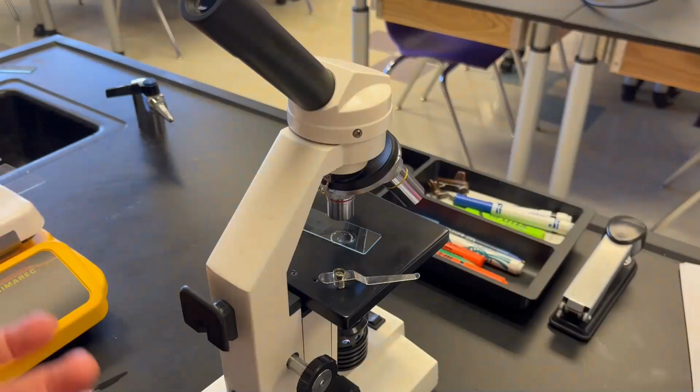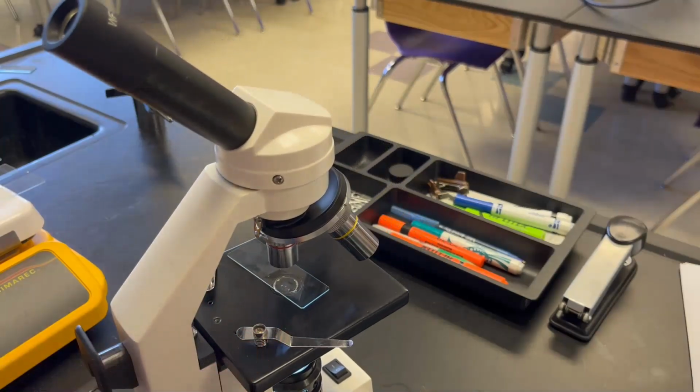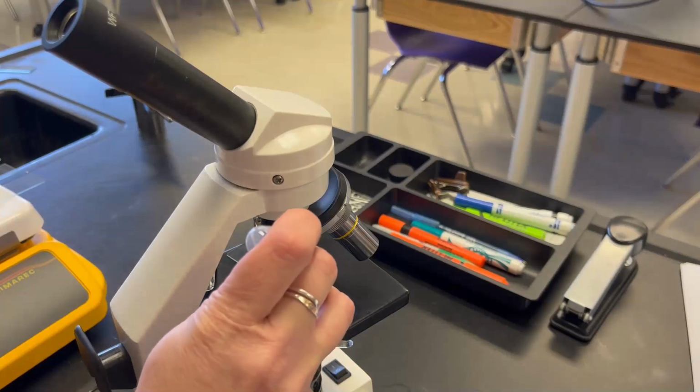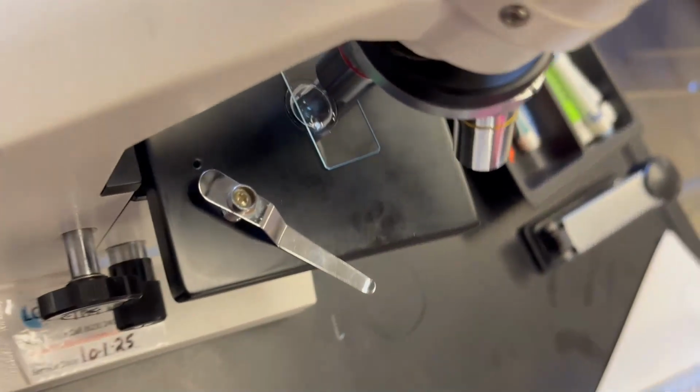When they first look through, obviously they're not going to see anything because it's just wet and clear right now. But then after a few minutes, it will start to cool and form crystals in real time. If it's taking a really long time and students have been waiting and it's not starting, a little tip is that you can seed the reaction with a little bit of powder and just tap it on the edge. Then it will get that reaction started a lot faster.